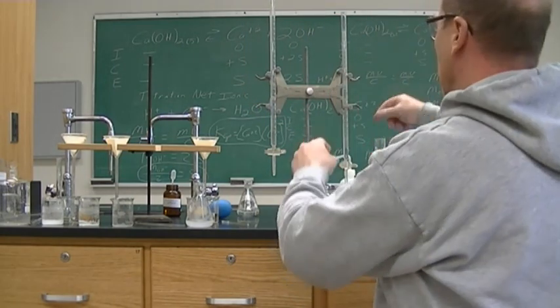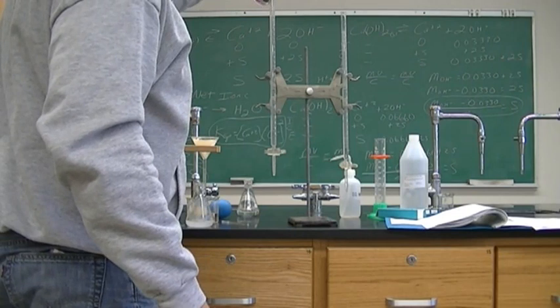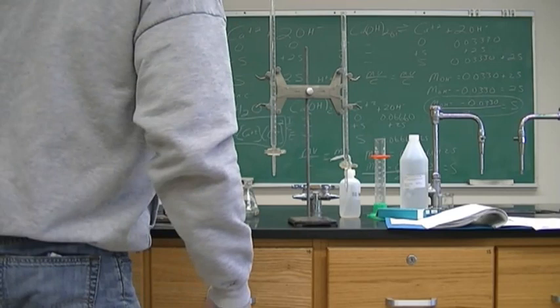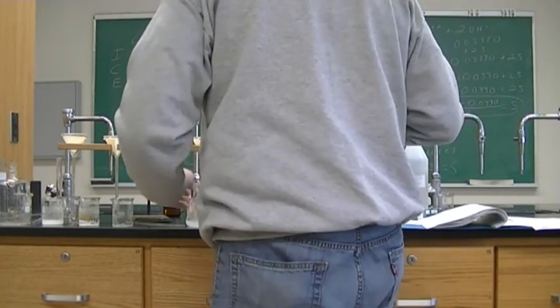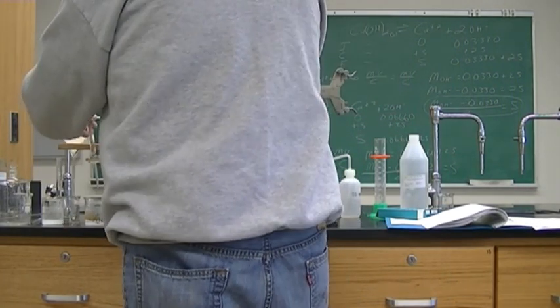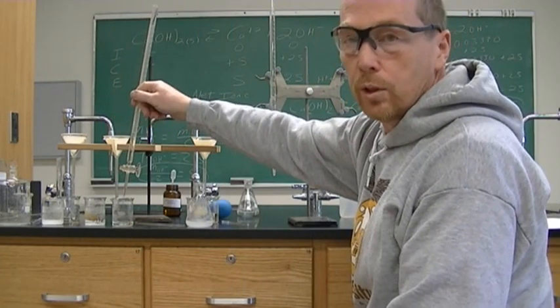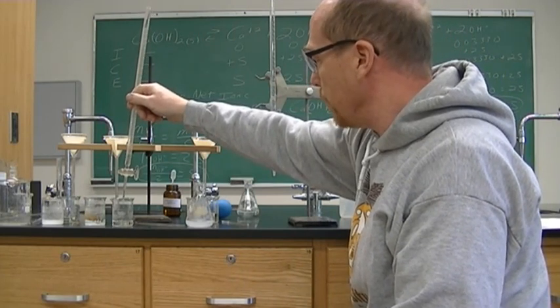All right, so now fill this back up. All right, so the third solution, we're going to also put that in our burette, and we're going to add the 10 mils from the burette again.